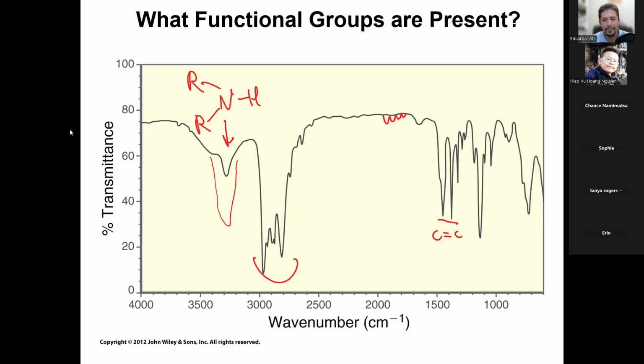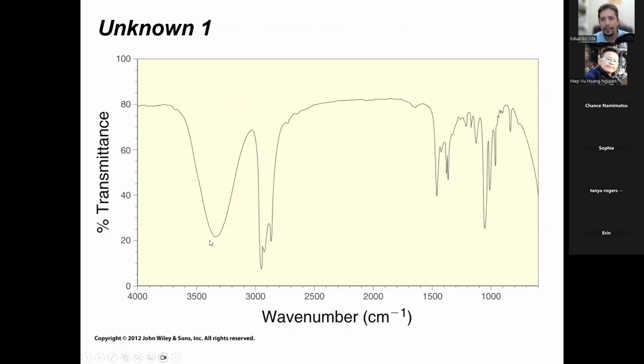Alrighty, moving on to the next slide. All right, unknown number one. Just more practice. What's in here? What are the functional groups here?